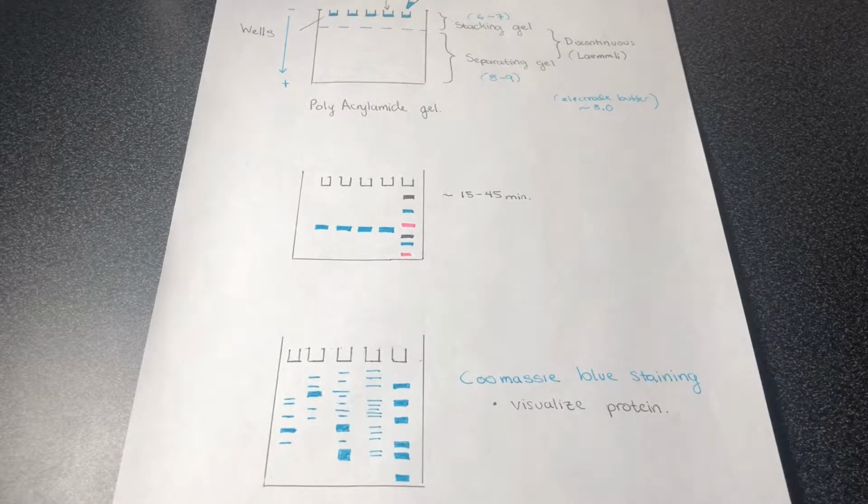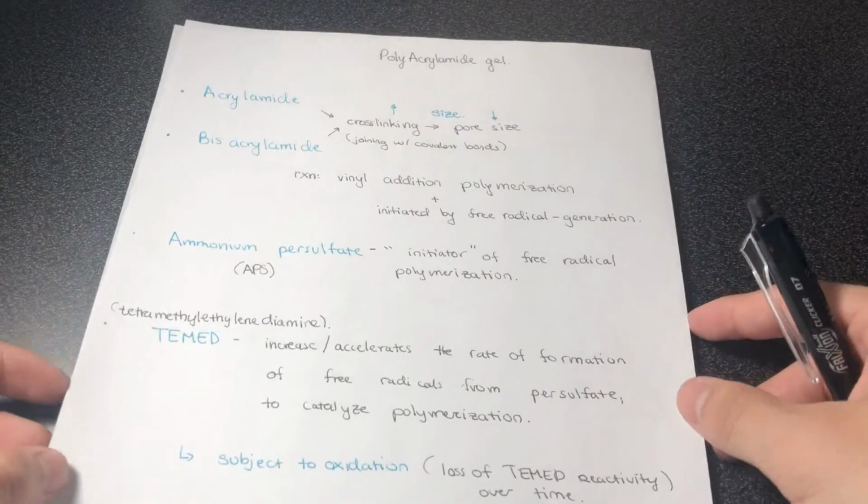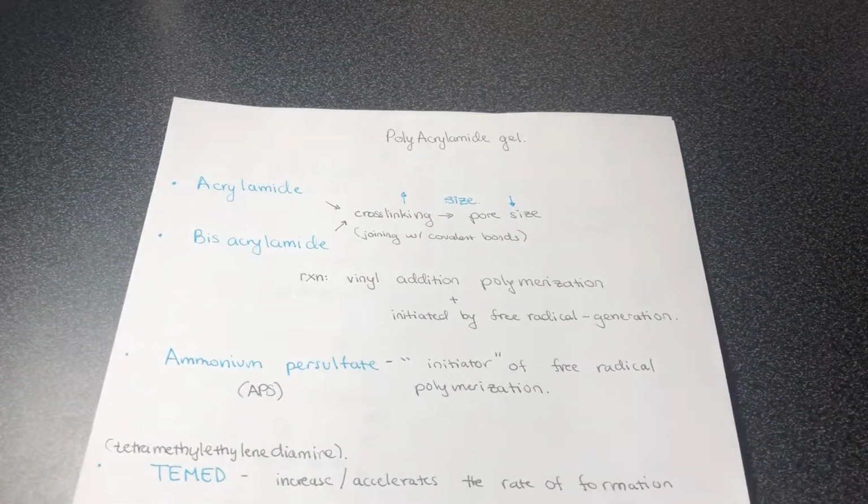But what I didn't mention was the acrylamide. So why is acrylamide important? Well, you have a few things. When you make the gel, you can have a precast gel, which is something that's pre-made. But more often than not, you have to make your own gel. You have acrylamide and bisacrylamide.